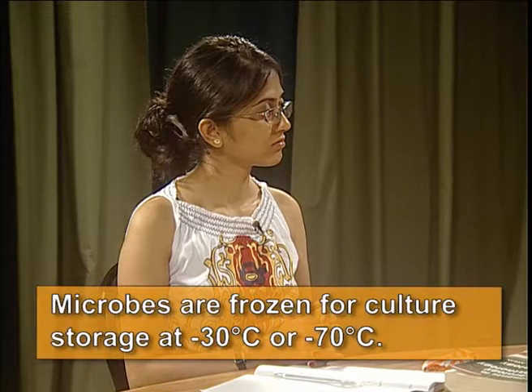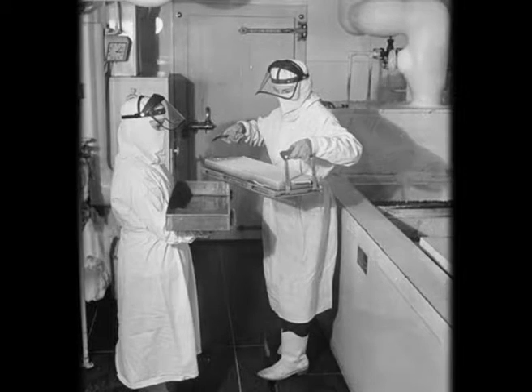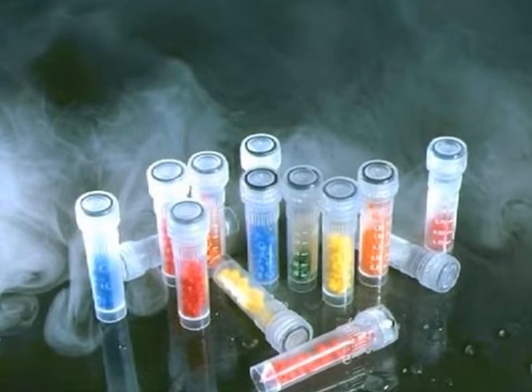Many times we prefer to restrict the growth of microorganisms by freezing or by refrigeration. Here we refrigerate at -30 or -70 degrees centigrade. These methods are used for maintenance of bacterial cultures. As the things are frozen and water is taken out from them, the cells stop replicating, they stop reproducing. But they are still viable. They are not completely killed.